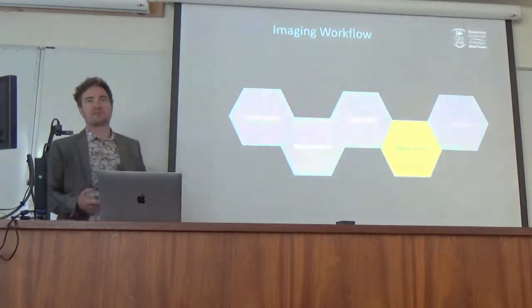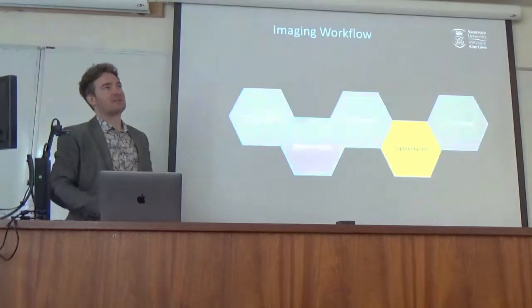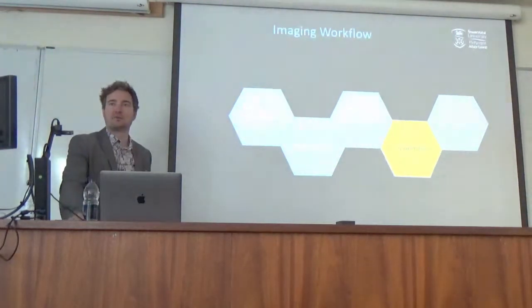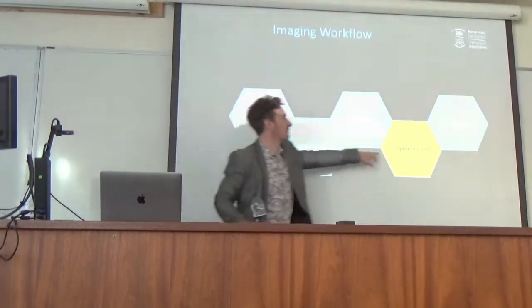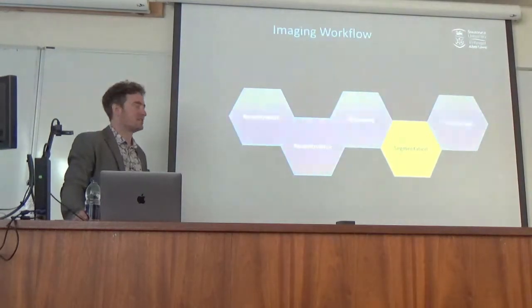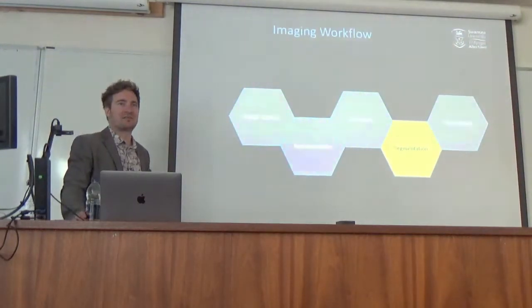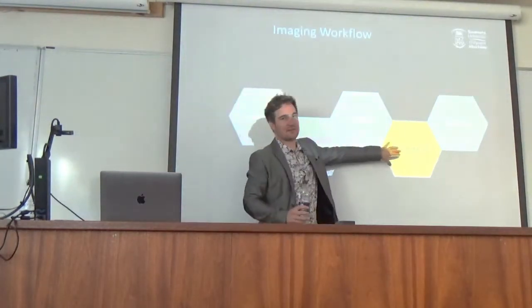But when you hear microscopists at conferences talk, almost jokingly, about how the PhD student spent 3 weeks segmenting that sample, yet we're talking about image capture, reducing a scan time by 10 minutes, and a whole talk on that. This is where I think the wasted resource is. Having a PhD student spend weeks segmenting a data set is just not acceptable. It's not funny to talk about in a conference as though it's a badge of honor that your group spends huge amounts of time doing that. So I think that's where, for us as a field, we can benefit.